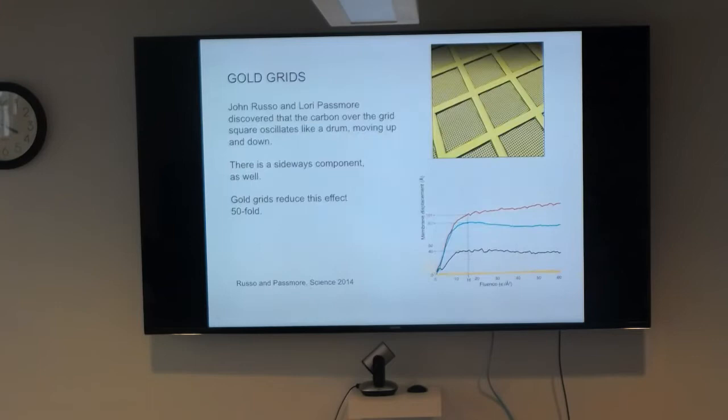And gold grids, they were introduced in 2014 by people at the MRC, and they are now very often used. And here is this effect that I was talking about, the vibration in Z direction, which normal grids are doing. Here the gold grid is just a flat line with minimal effects like this, and the other ones are sort of going all over the place.